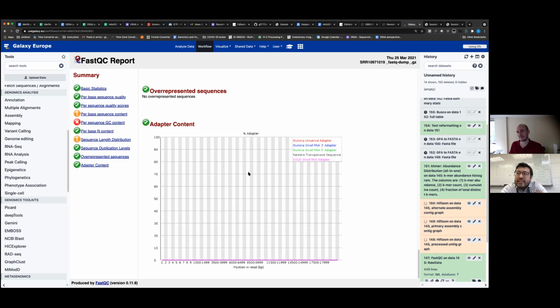Most of the time, these adapters are going to cluster together and create a weird little contig. But we've seen some cases where they got incorporated into the real contigs. So you have to make sure. Actually, when you submit an assembly to NCBI, for instance, they check for adapter contamination because it's very common. It could be a separate sequence that they can get rid of easily, or it could be that somehow it made it into the sequence of chromosome 1, and so they masked it. They put Ns in that position.